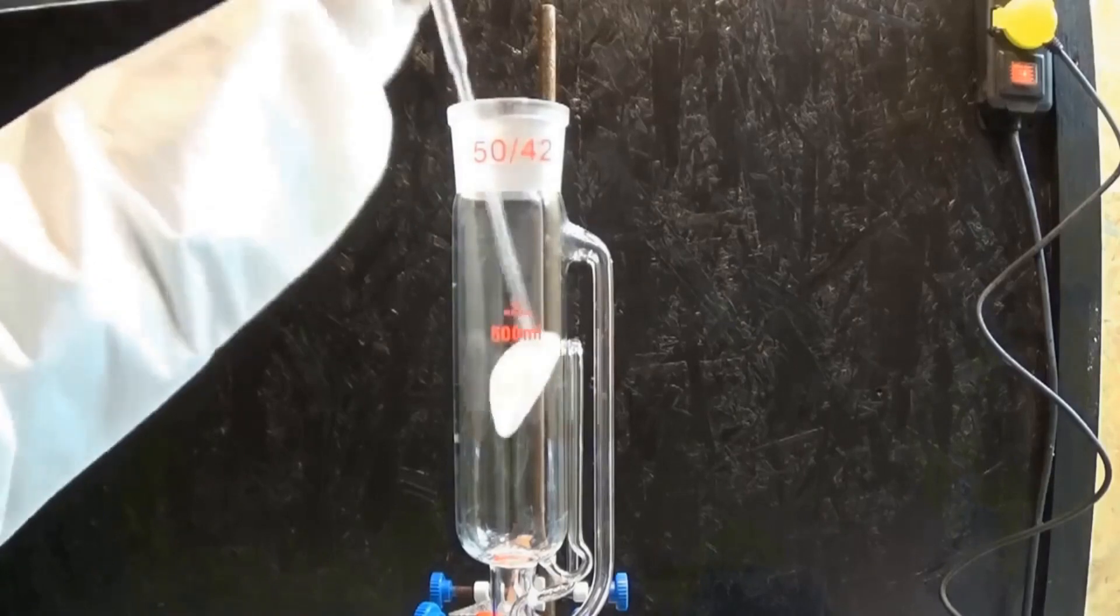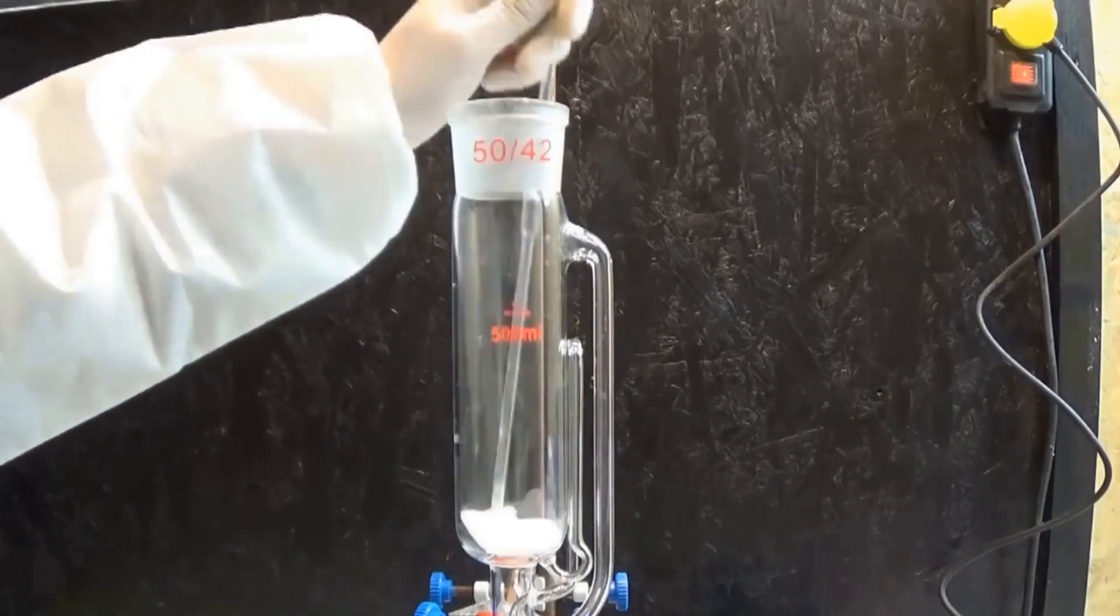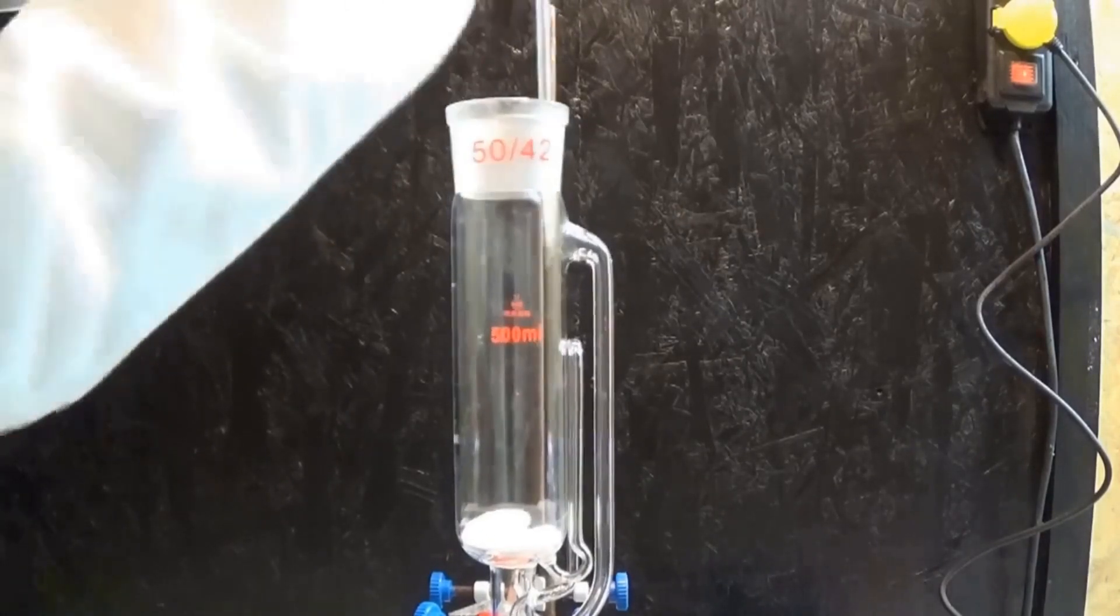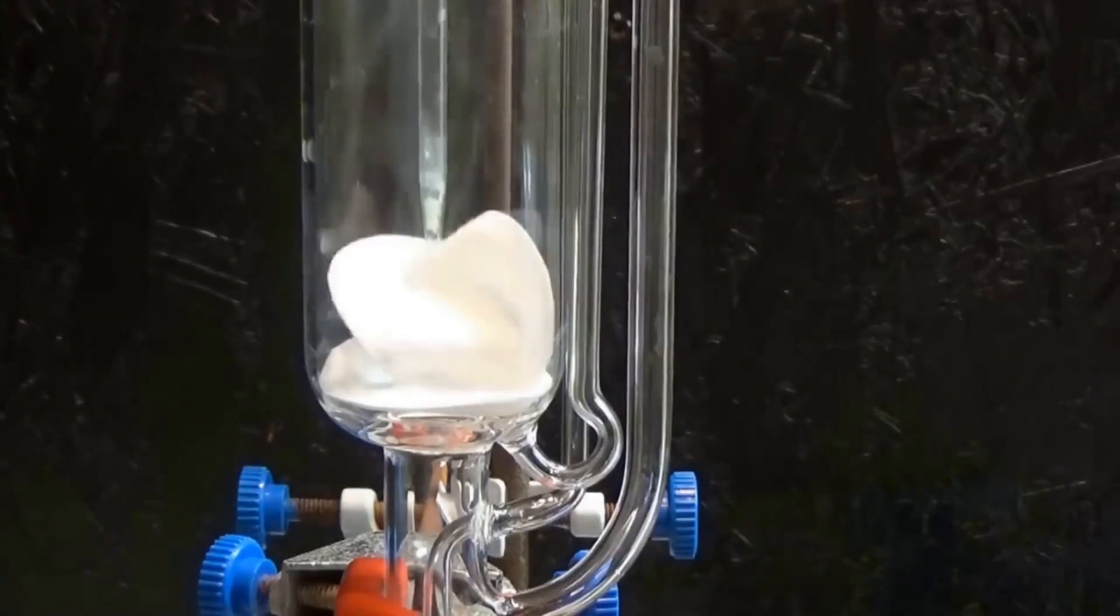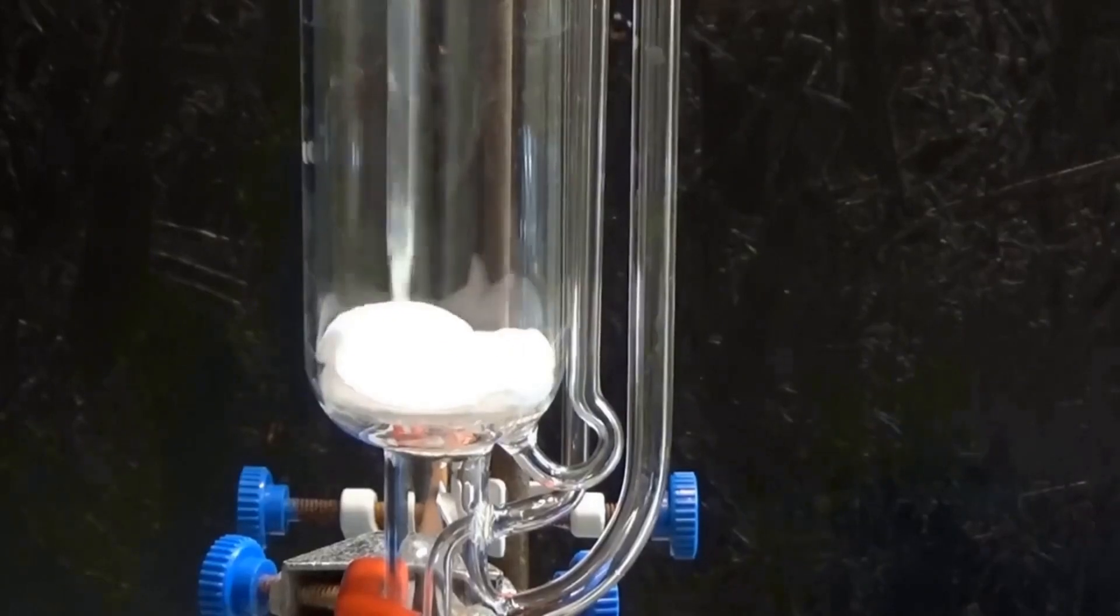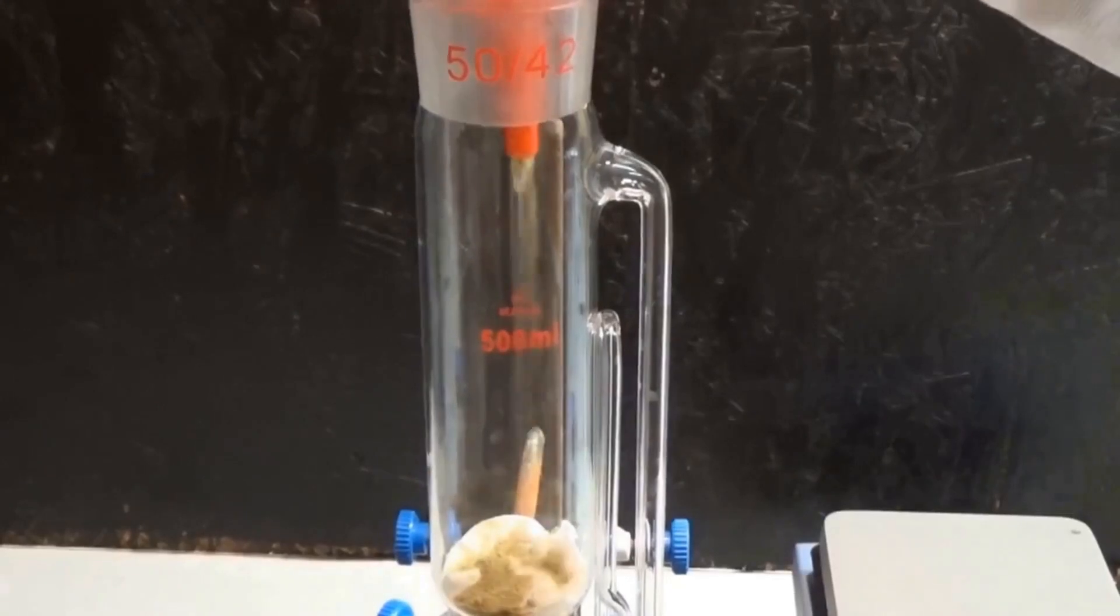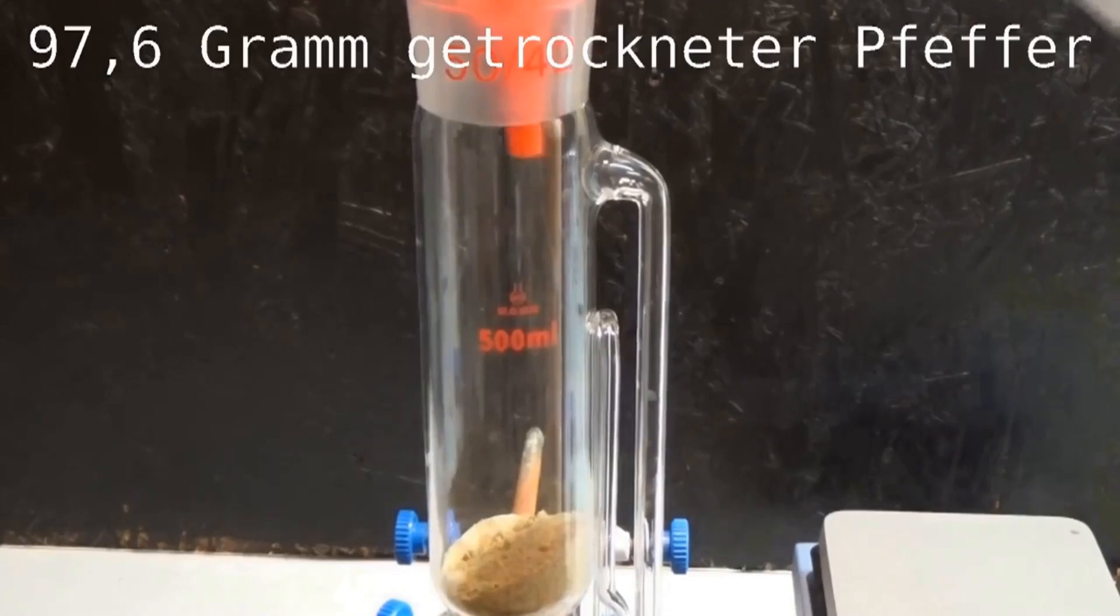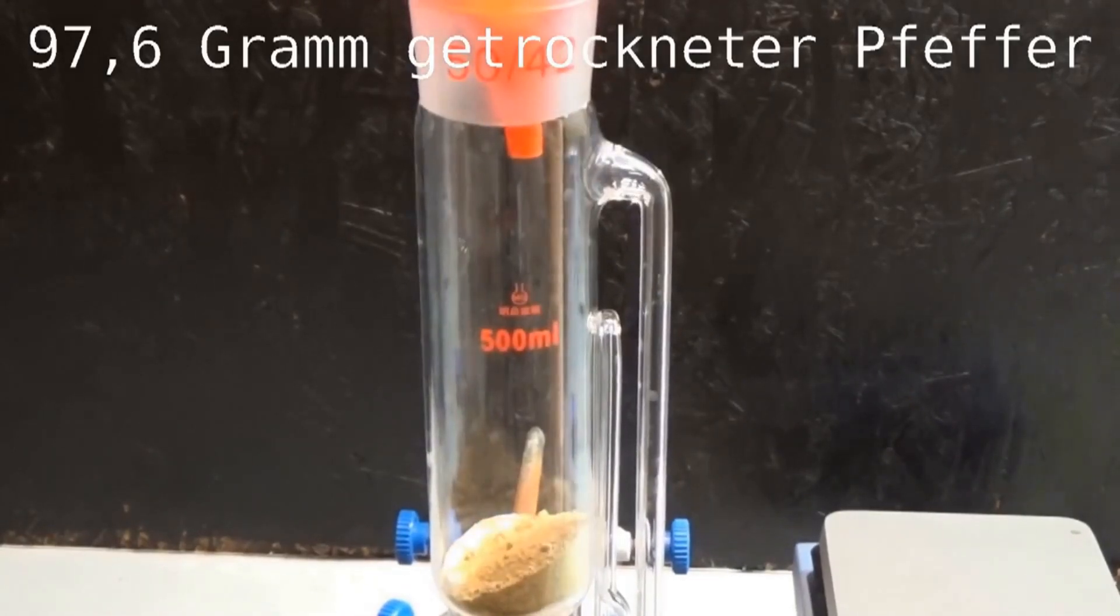Now cotton pads are inserted into the Soxhlet extractor to prevent the pepper from getting sucked into the siphon tube. This is one of two options, and you can also use a special cellulose shell for your extraction material. I decided to go with this approach because it allows me to fill in more material. But you have to keep in mind that your extraction material can lead to very slow flow rates of the solvent, thus decreasing the efficiency of the process. Now 97.6 grams of the pre-dried pepper are filled into the Soxhlet apparatus.